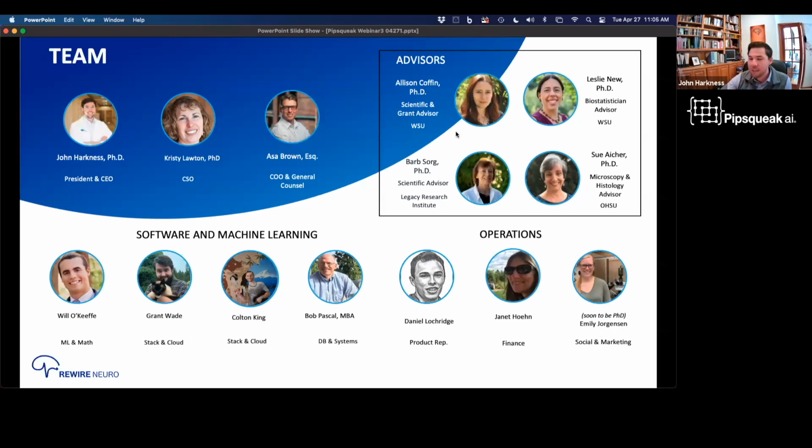Barb Sorg is probably someone who's familiar to a lot of you. She's the person that I did my postdoc with. So we've got some great advisors on our scientific board, but we have a ton of people who are developing the really neat features in Pipsqueak now. With us today, we actually have Will O'Keefe and Grant Wade, who are two of our software magicians who do some amazing work. All of the custom AI stuff that we'll show you today really goes to these two putting it together. So pretty cool.